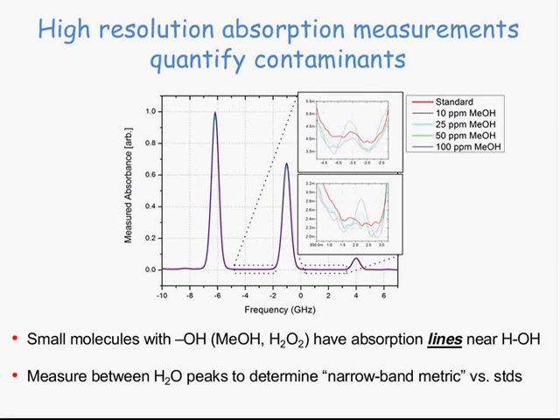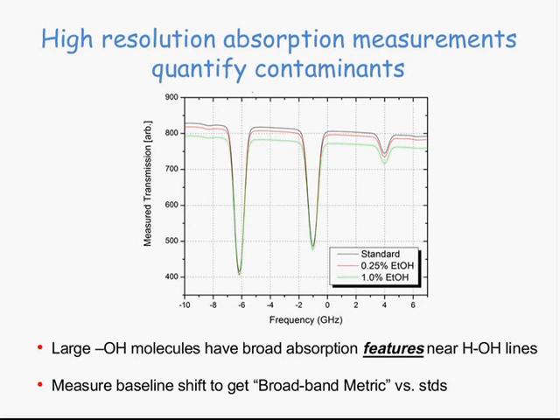Because we have the high resolution spectrum, we're not looking for specific molecules. We're looking for changes in the spectrum. And every spectrum is saved on all of our instruments going back. So anybody who has old instruments, has old data that they want to check, can open up their old data and check it. It's all there, all the spectra are there. And it doesn't look, like I said, for a specific molecule, only for any changes in the spectrum. Larger molecules that do have OH groups tend to behave like ethanol and make this change, and that we can definitely see.